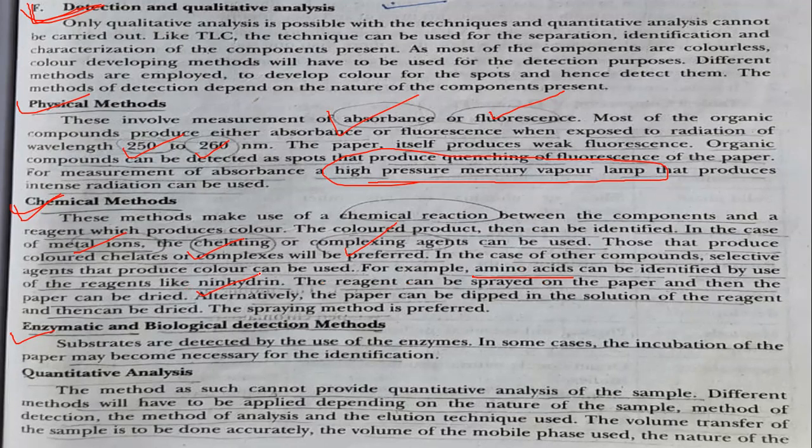analysis. In the chemical method, whatever components get separated on the paper react with the reagent, and then they show you color, or sometimes fluorescence, or absorbance, like this. These things happen, and that is carried out only to see the separation or the types of components present in the sample.